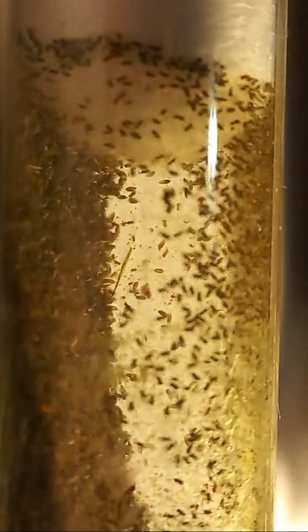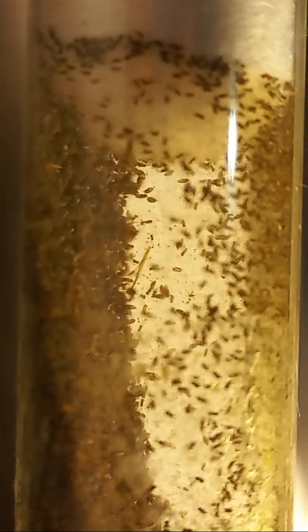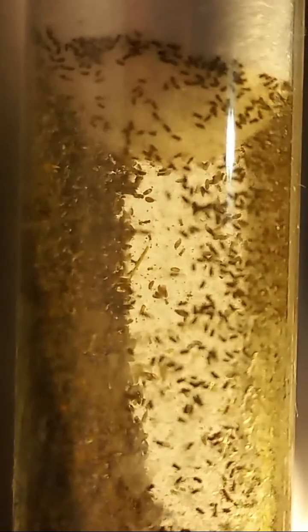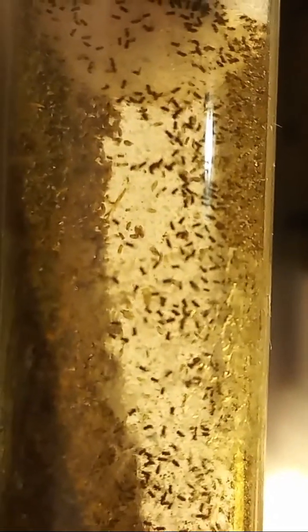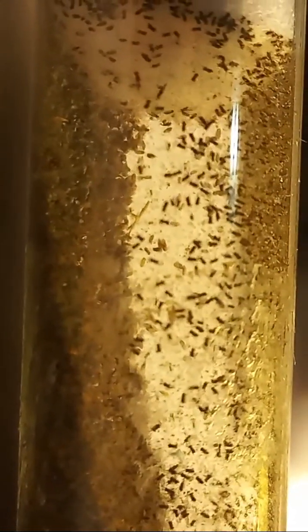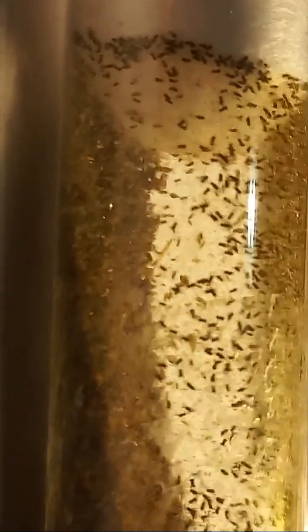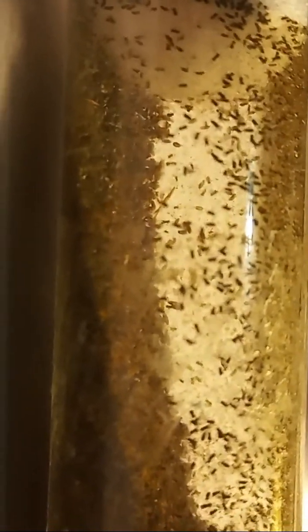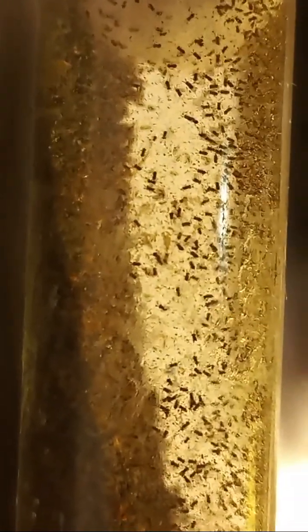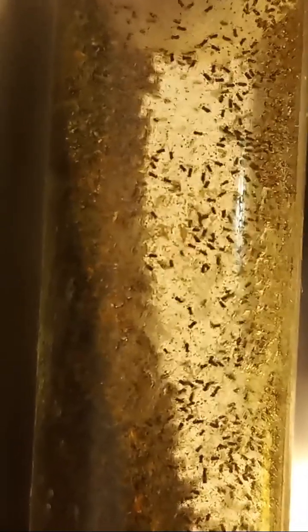I was pleased to show my nice parasitoids just online, because I made high magnification pictures and video of Trichogramma under another microscope, but it was more difficult to show them online because they crawl very fast under high magnification, and on screen I can receive just a few of them.